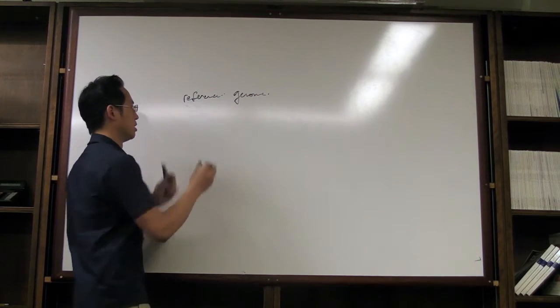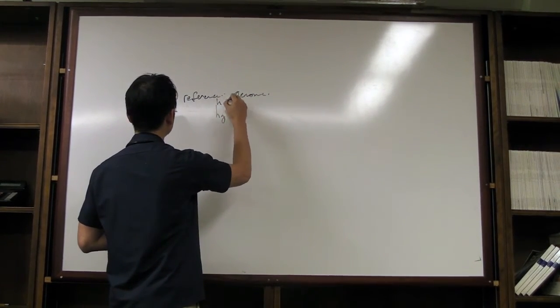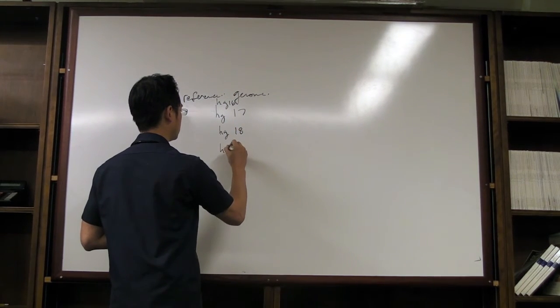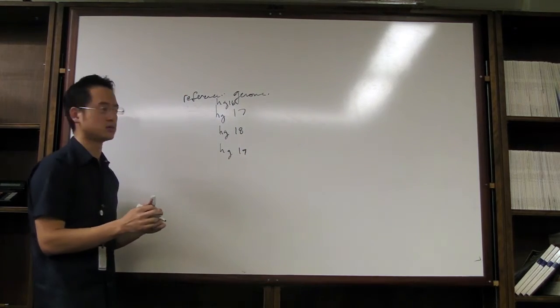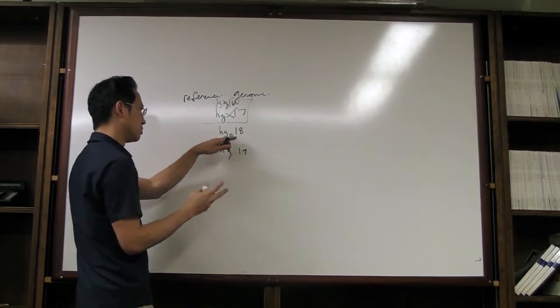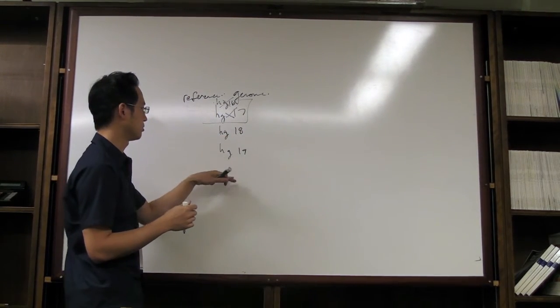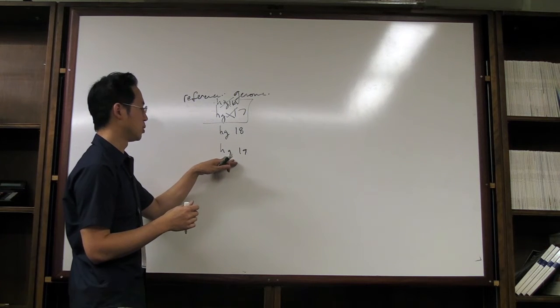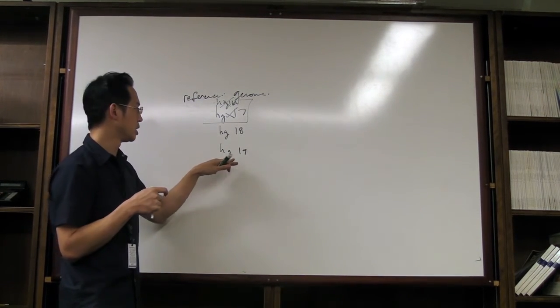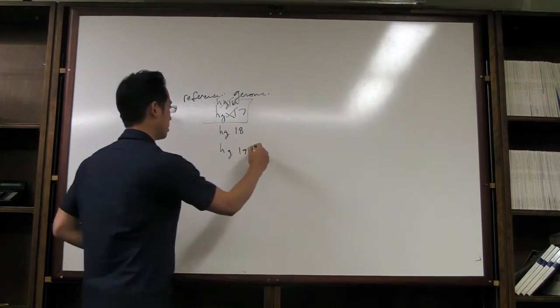So for the human genome, there's HG17. I think there was an HG16 as well. HG18, HG19. We're now at HG19. It's the current version. These older ones you don't want to use anymore. This one, still useful because it's very well annotated with all of the information that you're looking for. HG19 is probably the better one because it's going to be better supported. Probably includes data from the 1,000 Genomes Project, et cetera, et cetera. So this is the one you want to use.